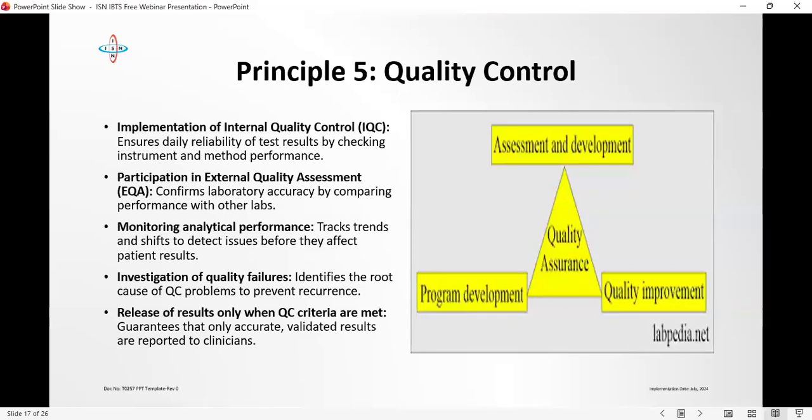You need to monitor all failed quality testing. Have you established a confidence limit for your quality control results? Does your lab say it is going to accept 3 SD deviations or 2 SD deviations, meaning that 95% of the time the results are within?